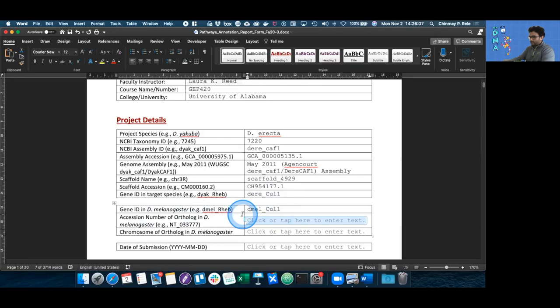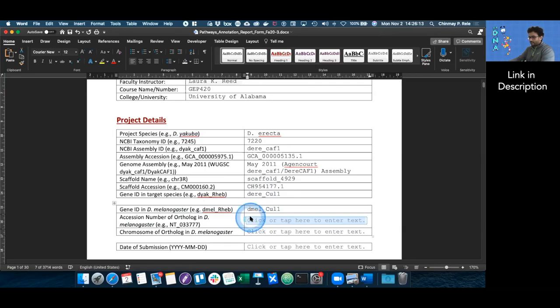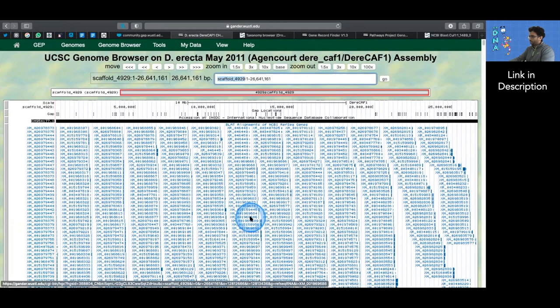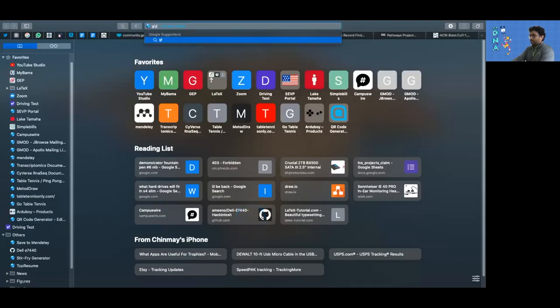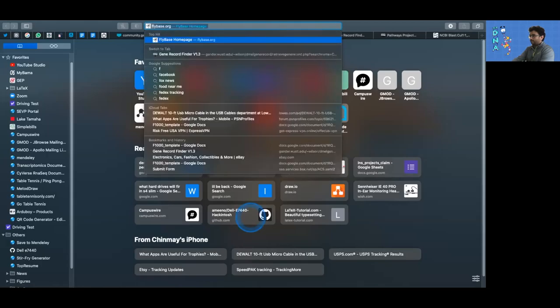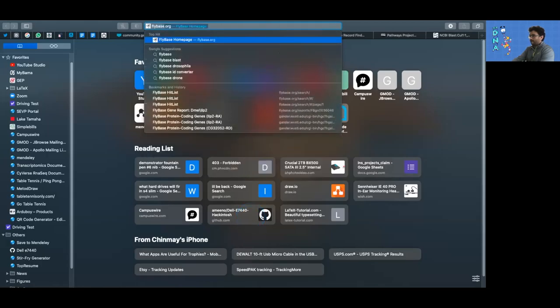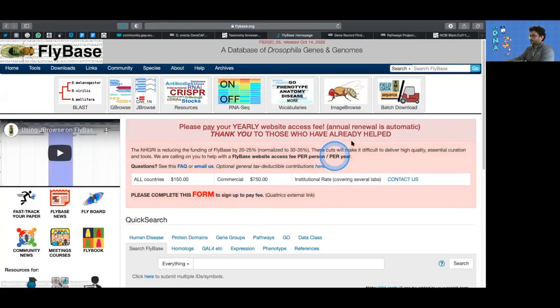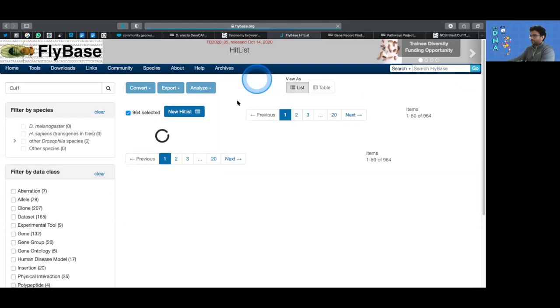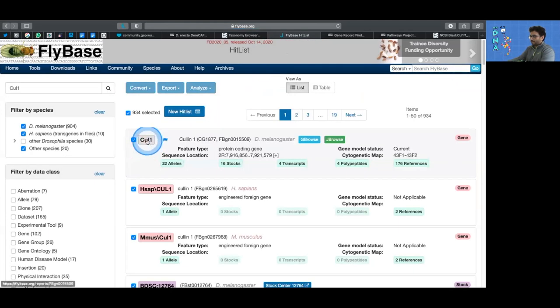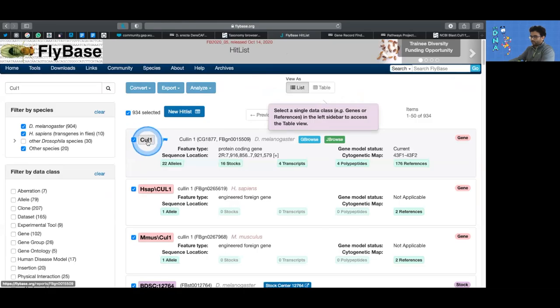Now we need the accession number of the ortholog in melanogaster. To do that, we need to go to FlyBase. We can just start going off to FlyBase and type in CUL1 in the J2G box or jump to gene box that pops up on the top right. Once it's done its search, we can just click on CUL1. There should always ideally only be one.